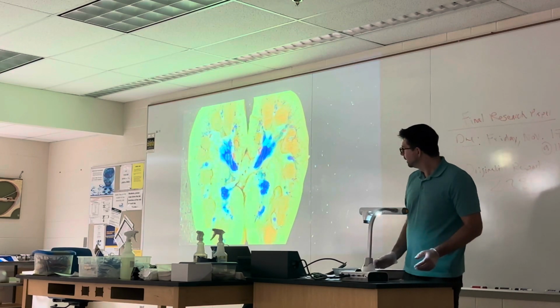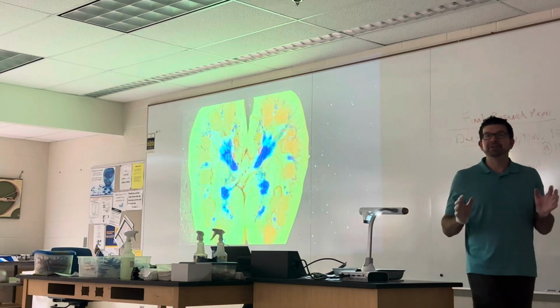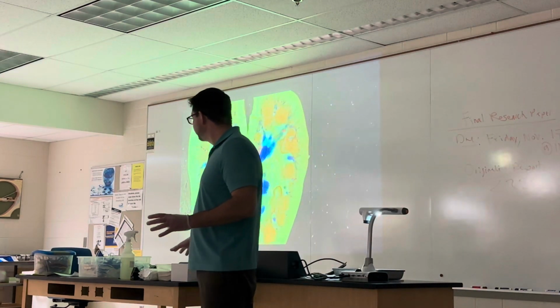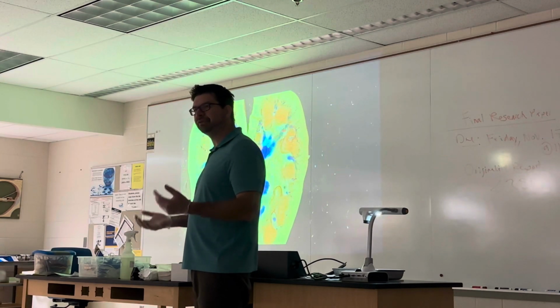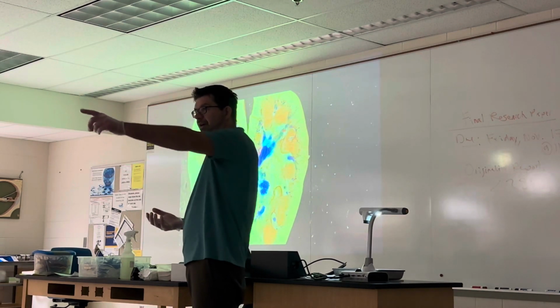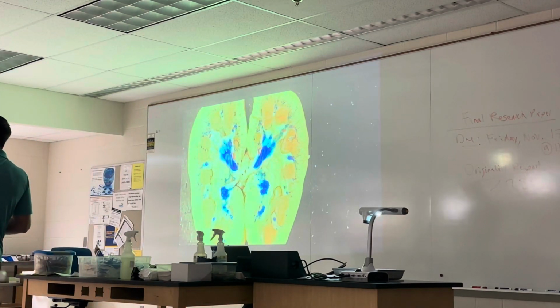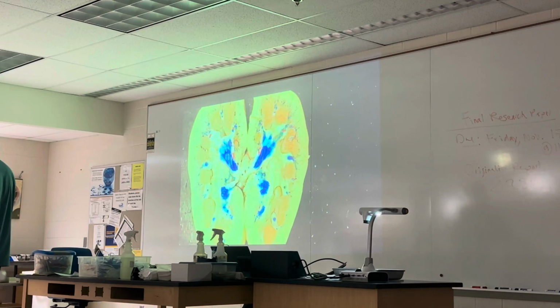Okay. All right, guys. So you have a lot of time to go over the models. There's labels up here if you want to use the labels. And again, if you do want to dissect the pig kidney, they are back there. Safety glasses are here. There are trays up there that you can use. There's also pins over here. I know some students like to use the pins to identify the structures.